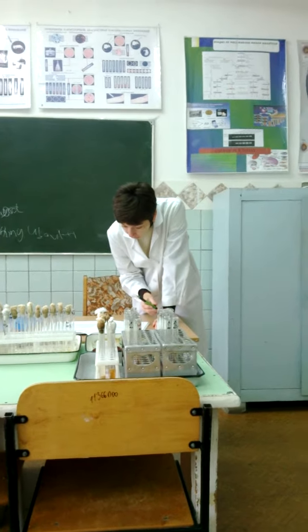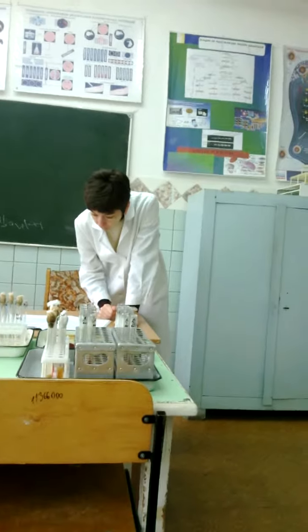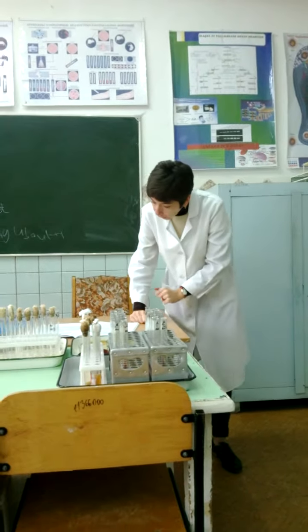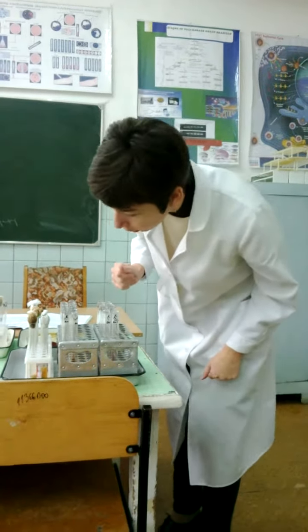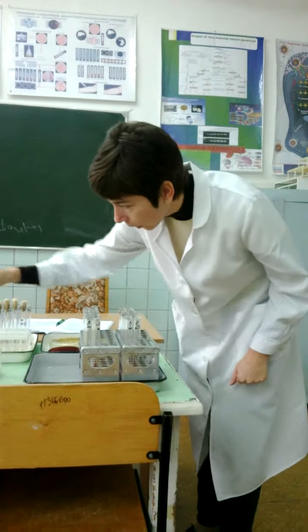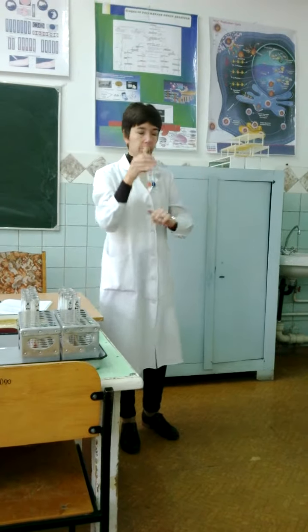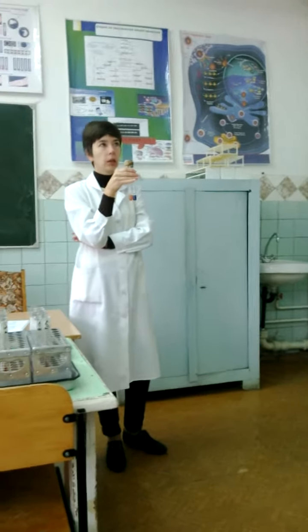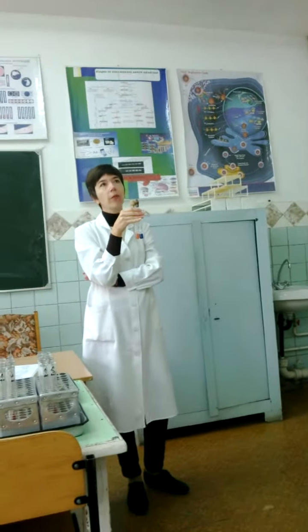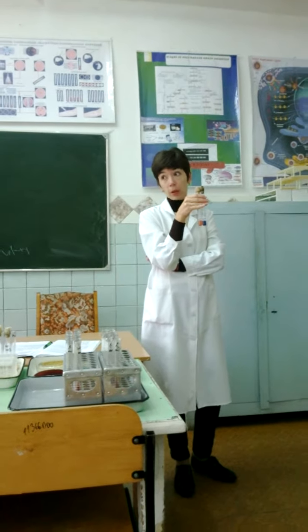Biochemical characteristics. The next is anaerobic mannitol fermentation. This is a test to determine pathogenicity, to differentiate Staphylococcus aureus, especially pathogenic from non-pathogenic Staphylococcus.